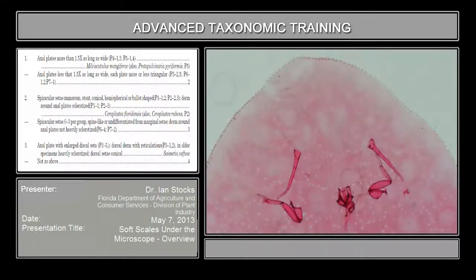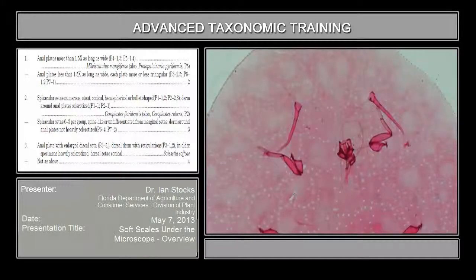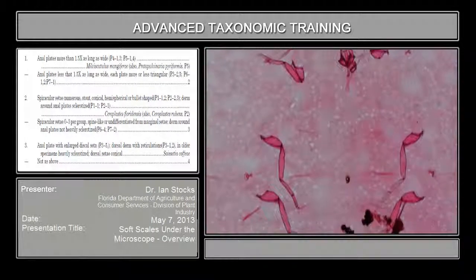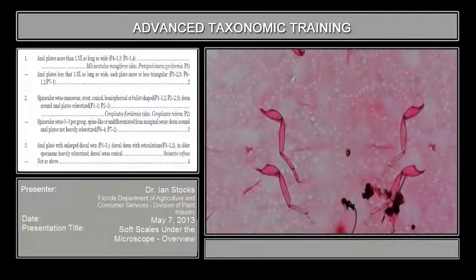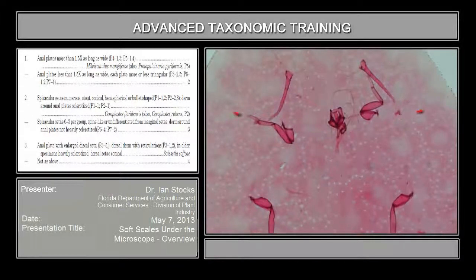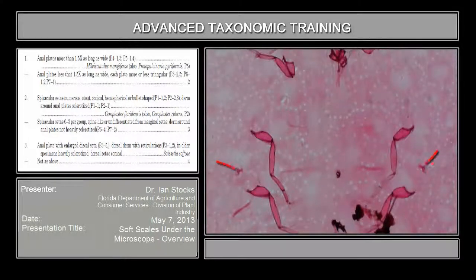A lot of this morphology is going to look in gross scale fairly similar to that of the mealybugs. The antennae, the mouth parts are quite similar, of course. The legs, the number of segments in a leg as you move down the body. You pick up the spiracles, the first pair of spiracles just to the side of the first pair of legs. The posterior pair of spiracles in this slide is just halfway between the second and third pair of legs.